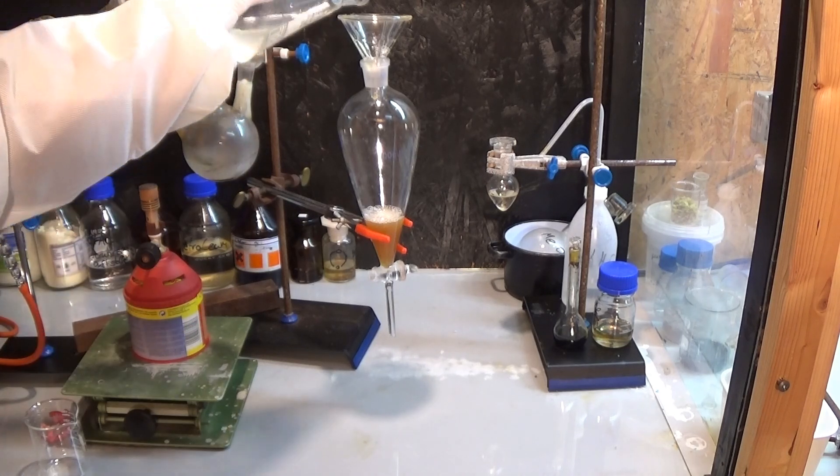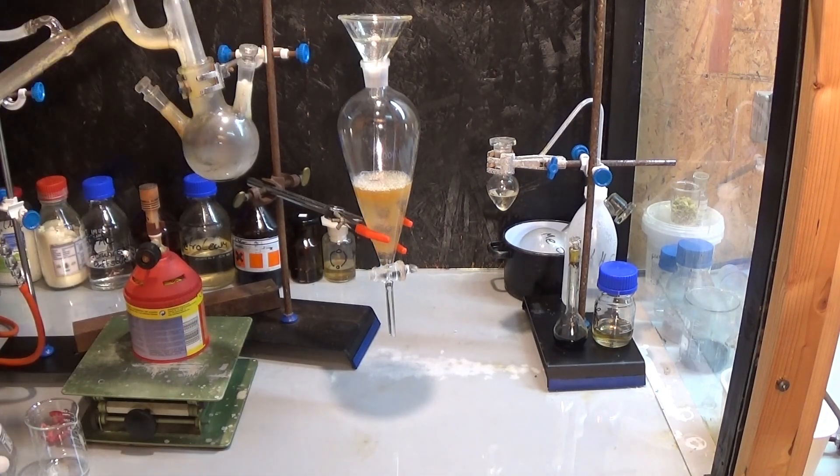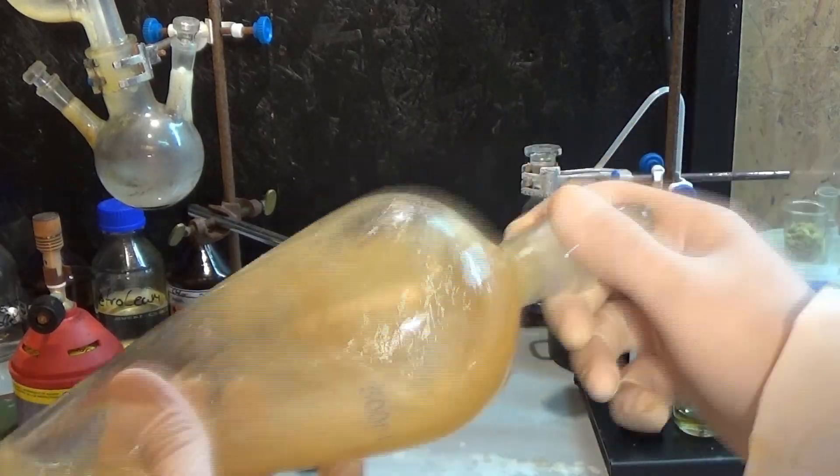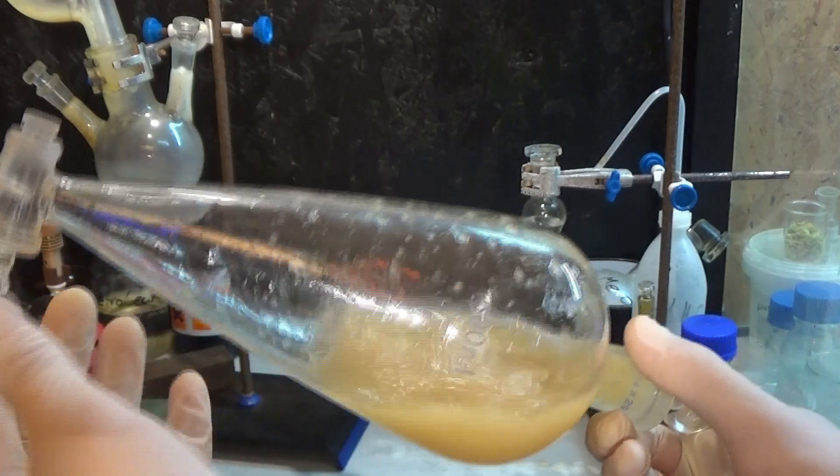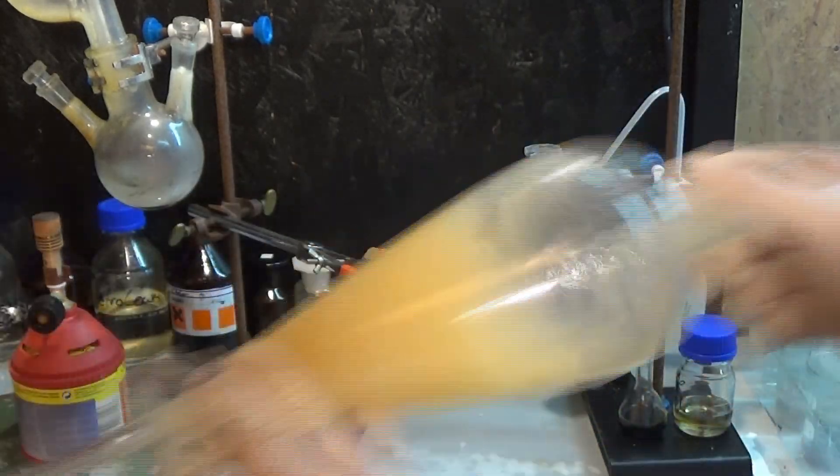Therefore we have to get rid of all components that are water soluble, so we wash it with some water. And like good cocktails, we shake it and vent, and shake again. Now we let it stand to separate and voila, we have some crude styrene.